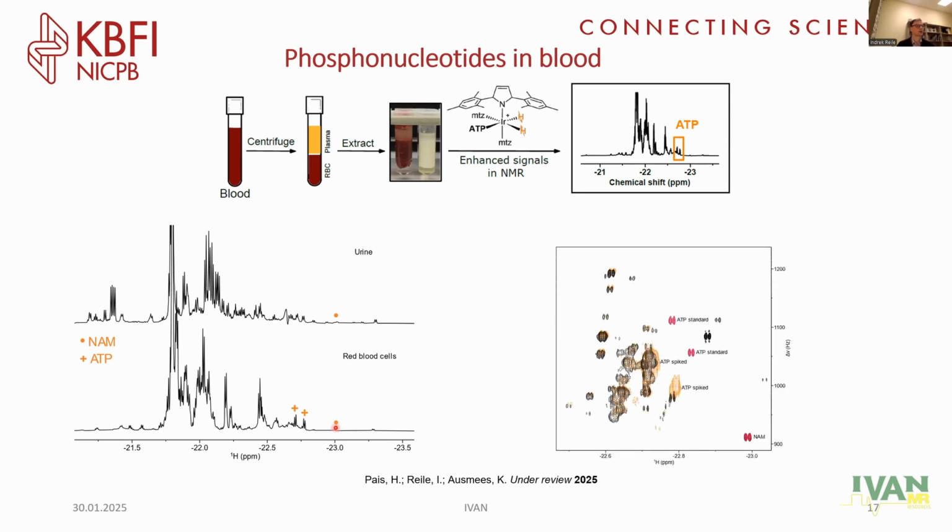But the trick here, why it took so much time, was that when we started, the red thing is ATP standard in a neat solvent. So we knew where it is, we knew how to do it. But on our very first spectra, which is the black spectra, it's a beautiful spectrum. We knew it has ATP in it, and a lot of it.